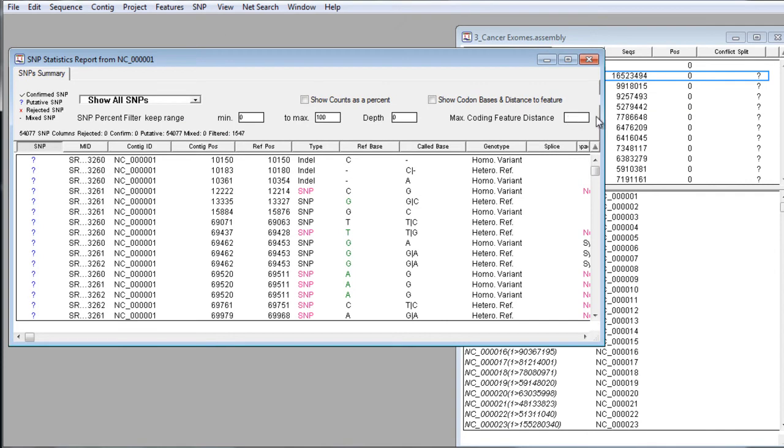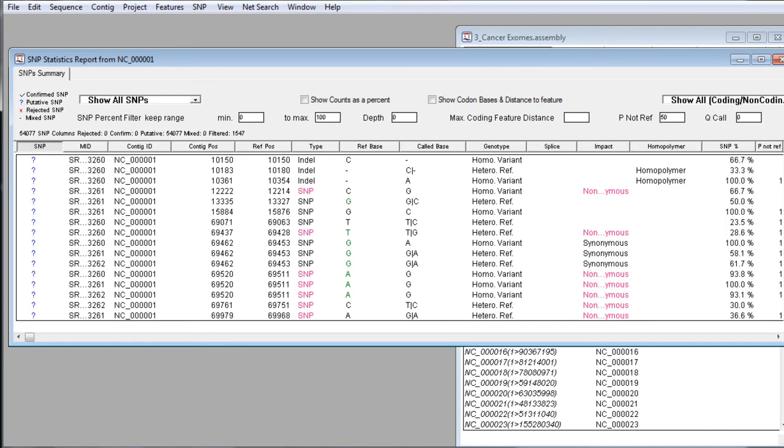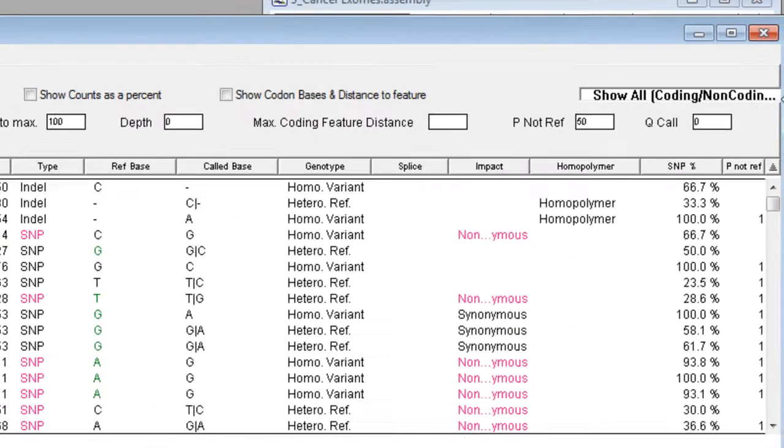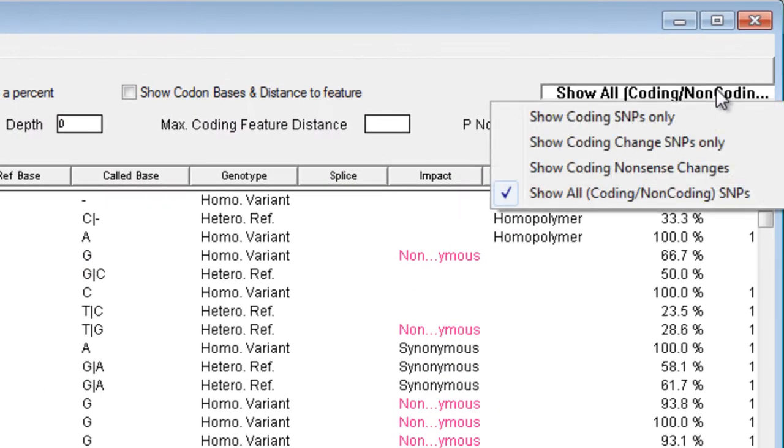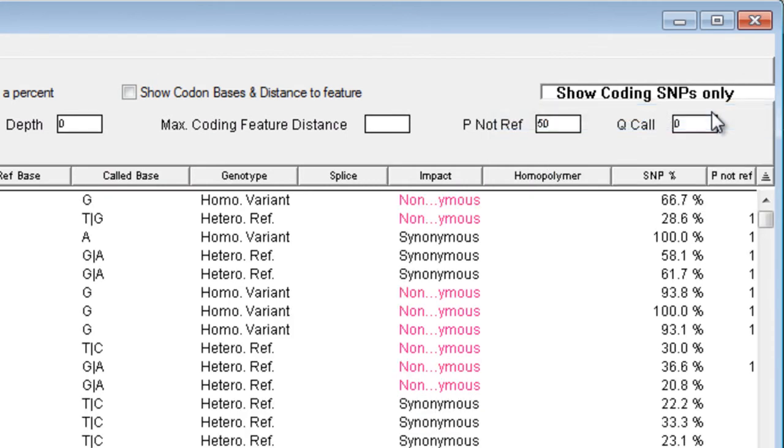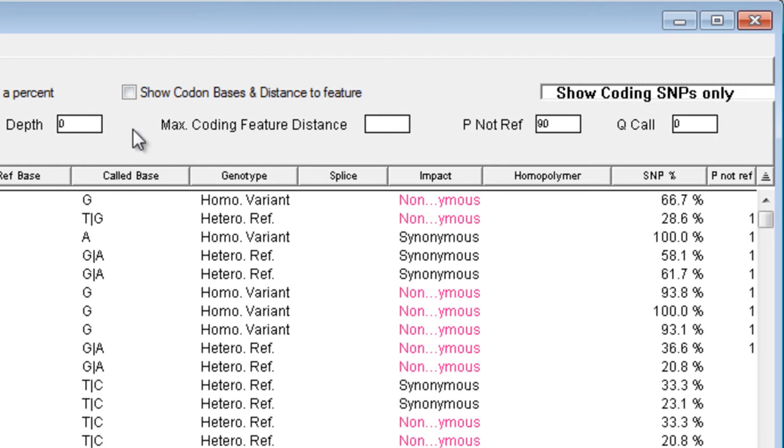we can see that we have many different options to filter our SNPs. In this case, we're going to want to show the coding SNPs only, and I'm going to adjust our P-value ref score to 90 and our depth to 10.